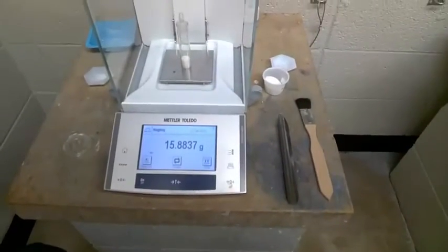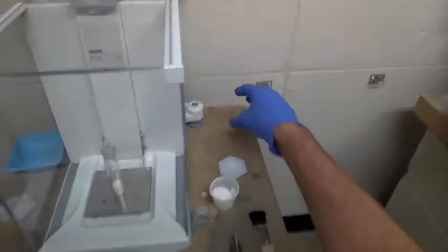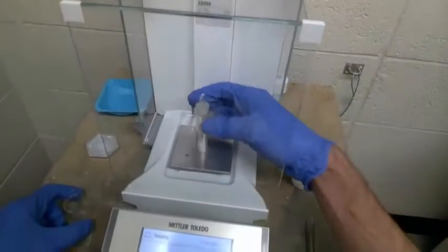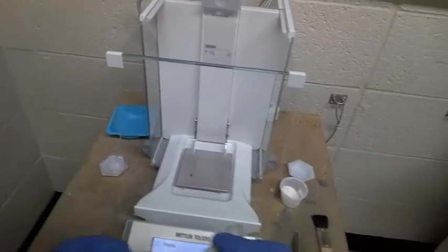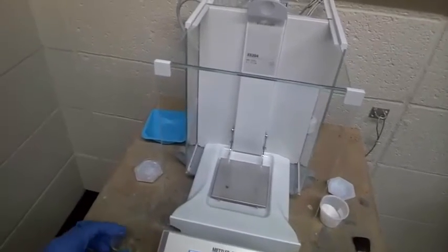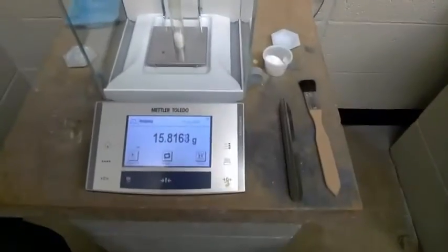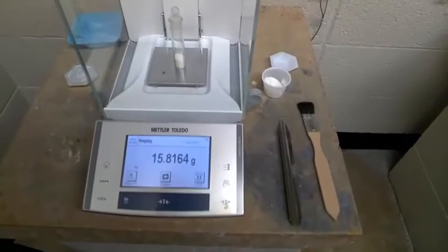Let's say we want to dispense 100 milligrams by difference. Instead of adding it to a weigh boat, we're going to add it directly to our vessel of interest. We dispense a little bit and see how much is left. You record that initial value, then dispense a little bit. We have about 15.88. I dispensed a little bit, put the lid back on, and now I'm sitting at about 15.81. So I've dispensed approximately 70 milligrams of material.